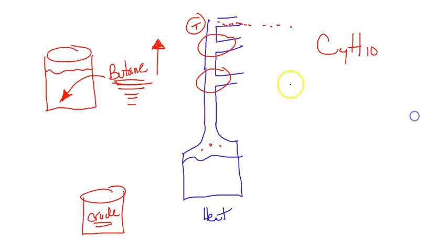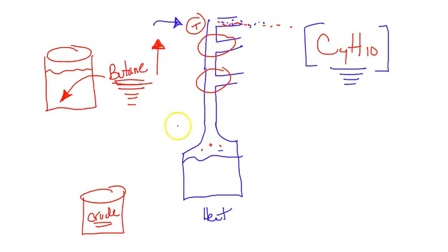No big deal. So the question in this lab is if it's quadruple refined, which may mean that it's been distilled this way 4 times over, because you may say, well, why would it be collecting at a certain temperature? Well, certainly butane holds its own intensive physical properties of a boiling point or condensation point. However, there's probably going to be other compounds with similar boiling points that would come with it possibly. It won't be 100% pure. So by doing it 4 times, we're supposed to have a very pure butane sample. So we're going to test the validity, or how pure the sample is.